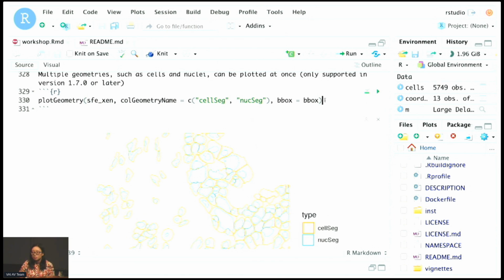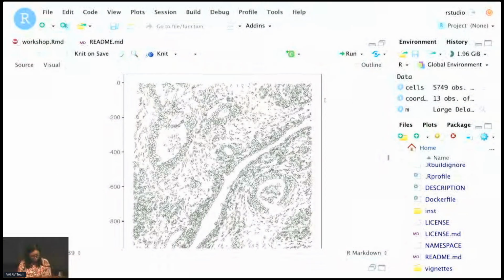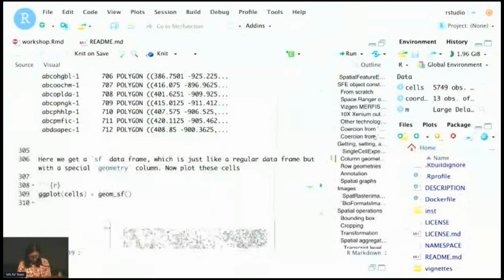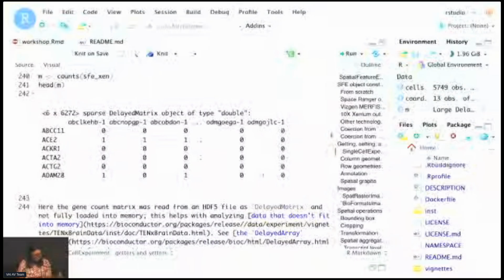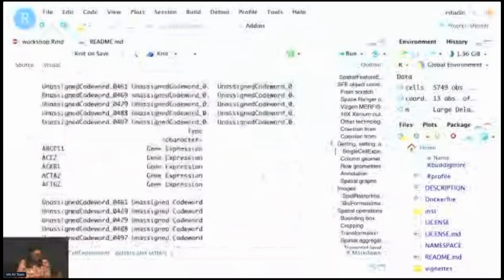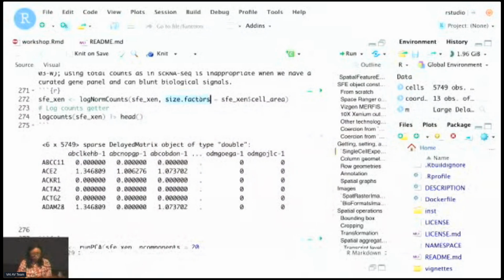I have a quick question. Yes. When you're normalizing your data, you're using single cell algorithms to normalize, right? Yeah. I've been reading a lot about how those single cell normalization methods are not accurate for spatial. Yeah, it's true, which is why the way I did it here is a little different from the standard single cell workflow. Here, I did not use the total counts, but I used cell area.